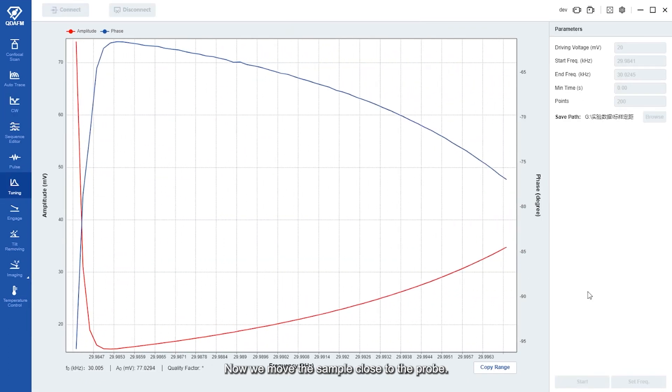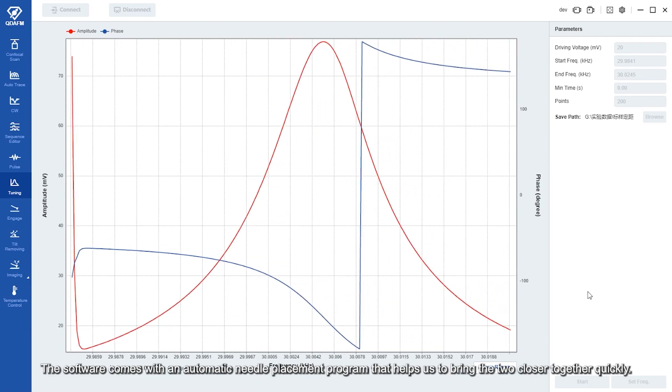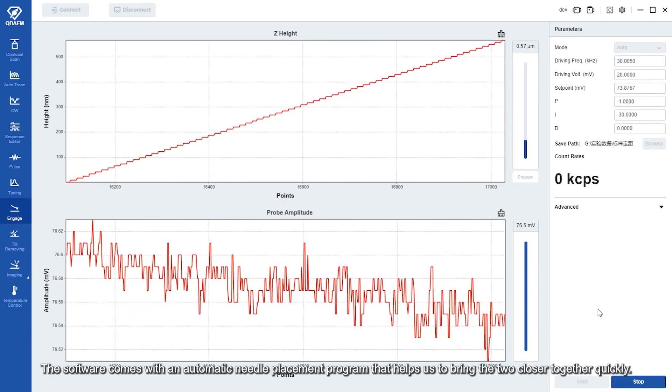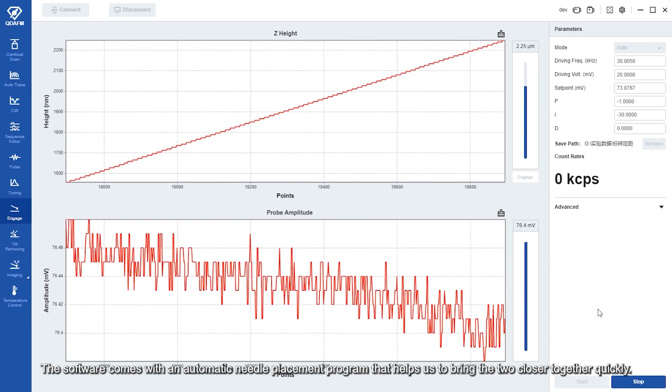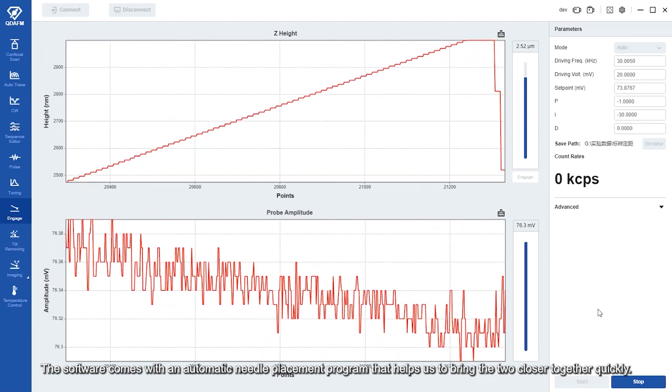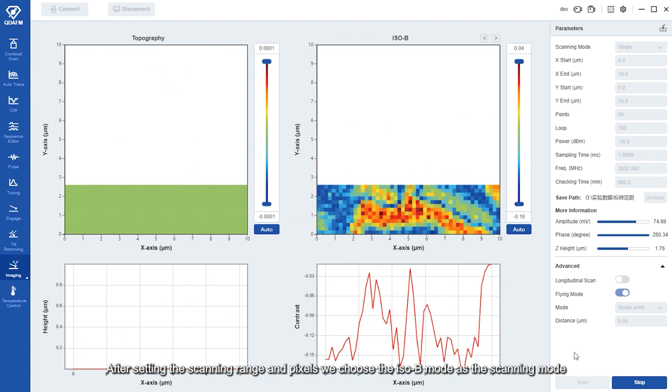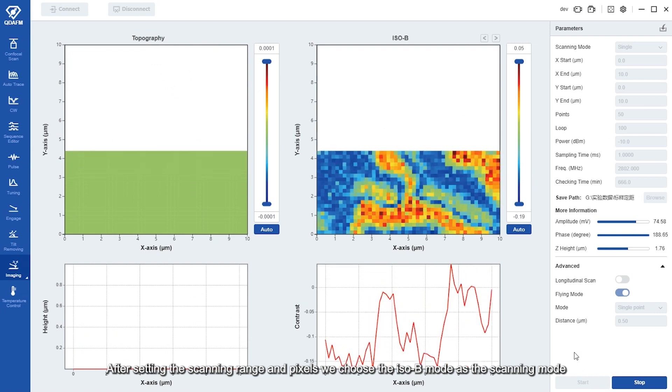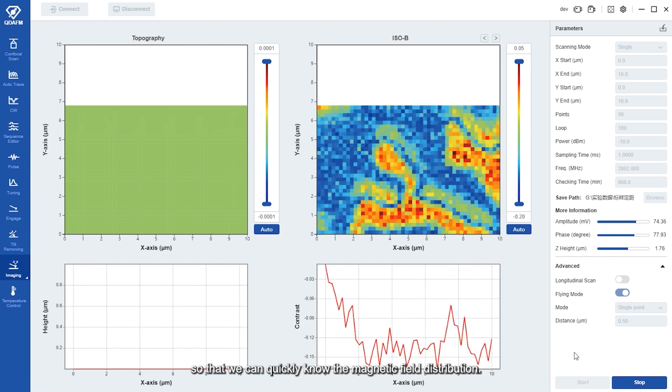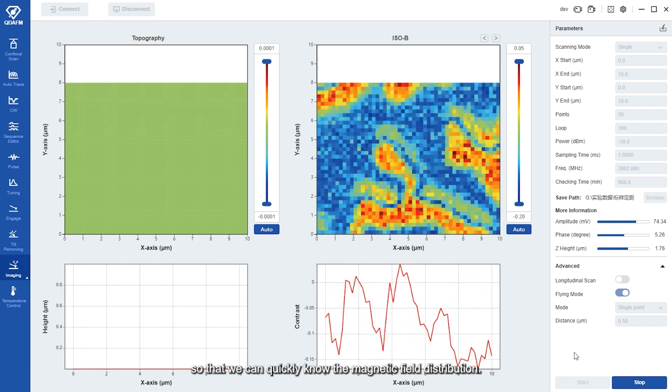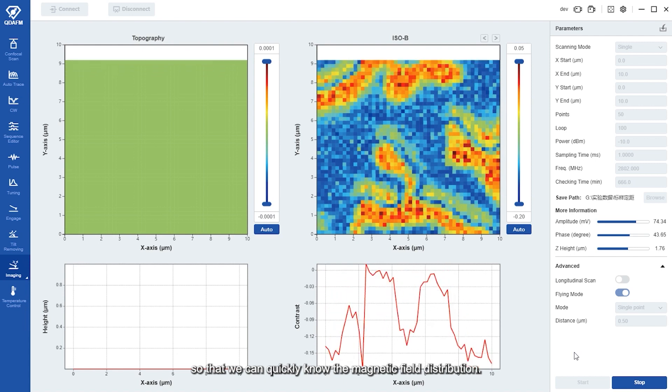Now we move the sample close to the probe. The software comes with an automatic needle placement program that helps us to bring the two closer together quickly. After setting the scanning range and pixels, we choose the ISO-B model as the scanning model so that we can quickly know the magnetic field distribution.